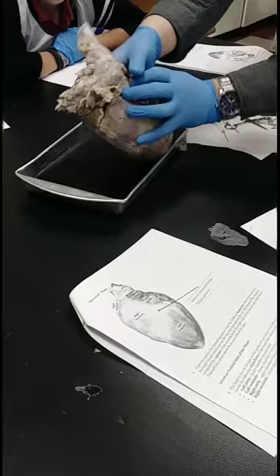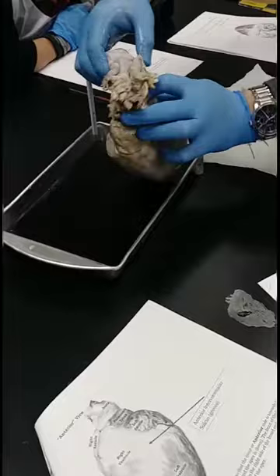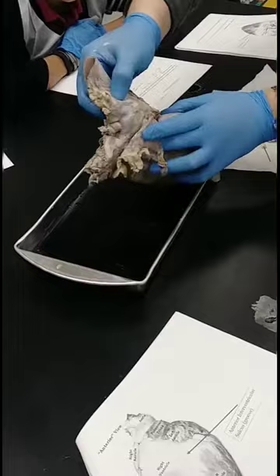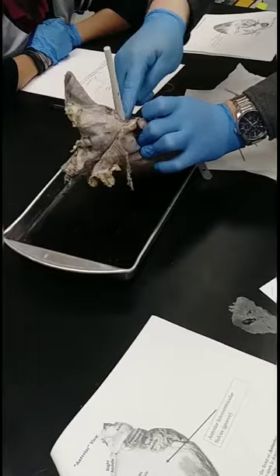On this, again, you have to open up a little bit. It's a little squished from being packed. But this whole big, thick thing here is the aorta. That's how thick it is. That continues all the way up here. And these thin things here, the veins are a lot thinner than the arteries. That's one of the pulmonary vessels we were talking about. See how thin it is?